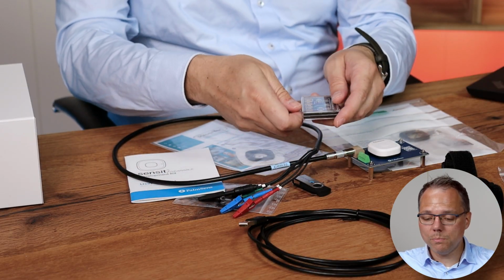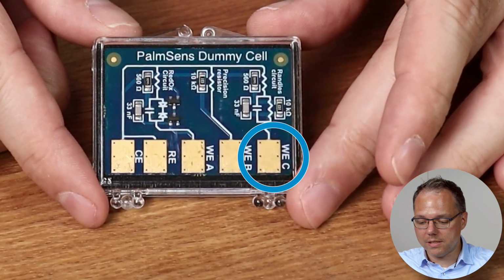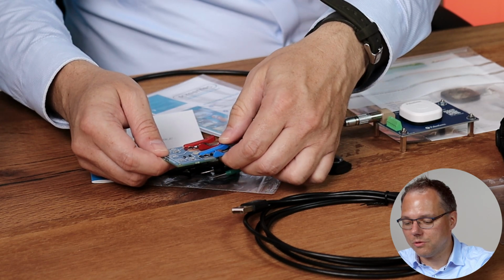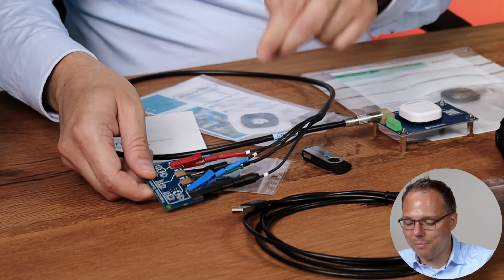Our dummy cell has multiple circuits. My first measurement will be an impedance spectroscopy, and a great circuit for that is the Randles circuit, which is the WEC on our dummy cell. So I connect the working electrode to the WEC, I connect the reference electrode to the RE patch, and the counter electrode, the black one, to the CE patch.